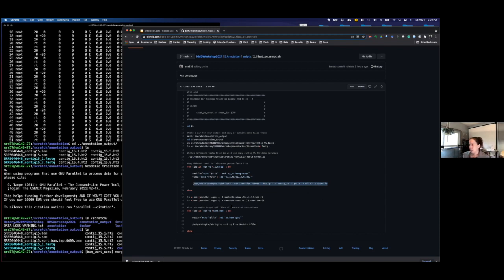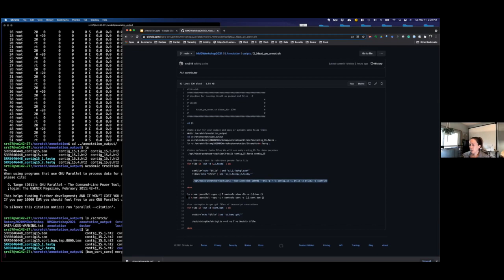All right, and then it just does some file conversion. Anyone that does a lot of bioinformatics knows that you spend a lot of your time either Googling stuff or reformatting things from one file format to another. Whenever the files are really big, this can be time consuming, but in this case it's pretty short. We only have one SAM file. The SAM file is the output of HiSat, and it tells you how all of your RNA-seq reads are mapping to the genome.